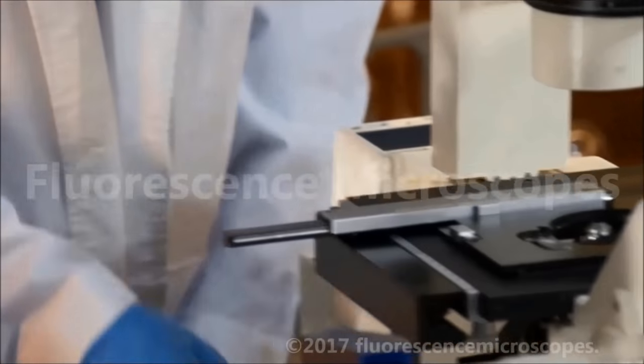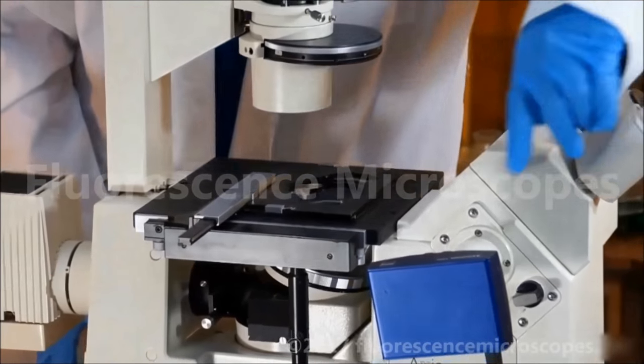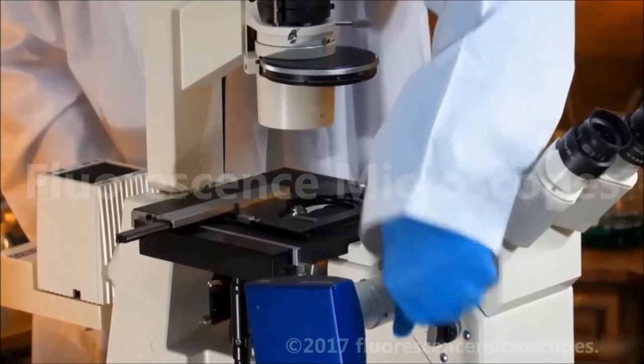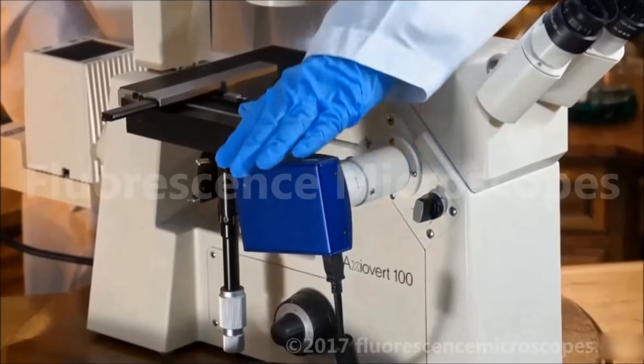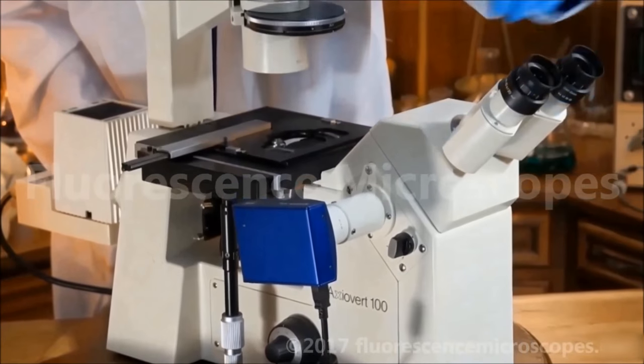This knob is for taking the image to either the eyepieces or the trinocular photoport. Turn it one direction, and it goes to the photoport with 70% to the photoport, 30% to the eyepieces.